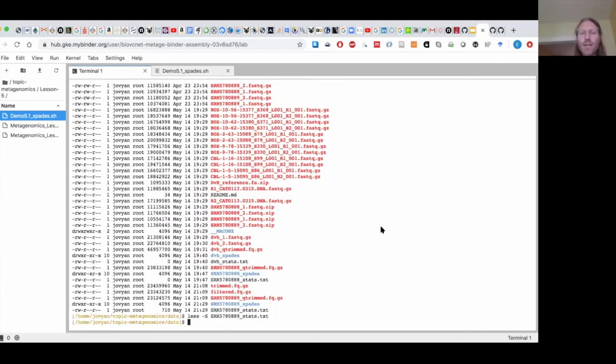that will go into the visualization of that GFA file in a little bit more detail next time, and then look a little bit more at the statistical metrics that come out of things like stats tool and Quast, which is another tool that we will use to look at the quality of our assemblies. And with that, I'll stop and ask if there's any more questions.